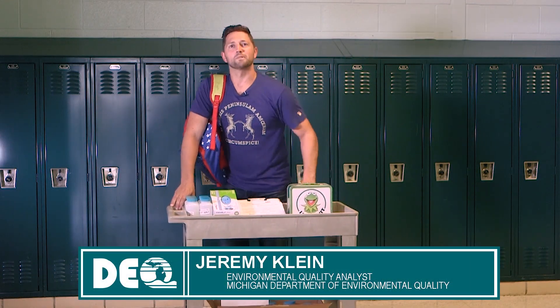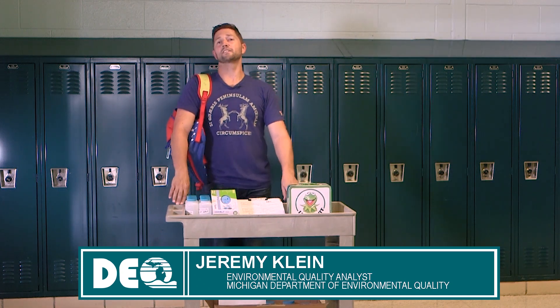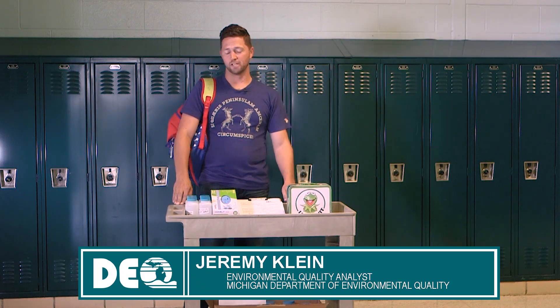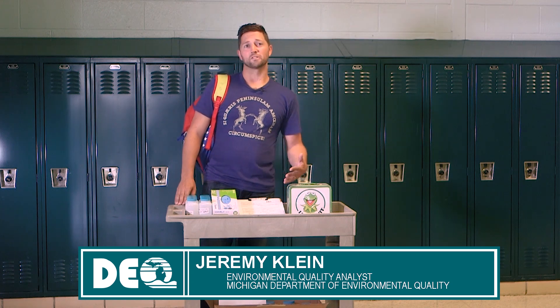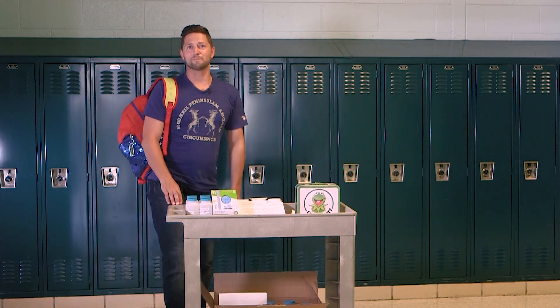Grab your school supplies and your sample bottles because the DEQ is taking you back to school. In this video we're going to show you how to conduct lead and copper investigation samples. So what do you need? You need your bottles, your gloves, paperwork, and a lunchbox would be handy. Now let's go sample.